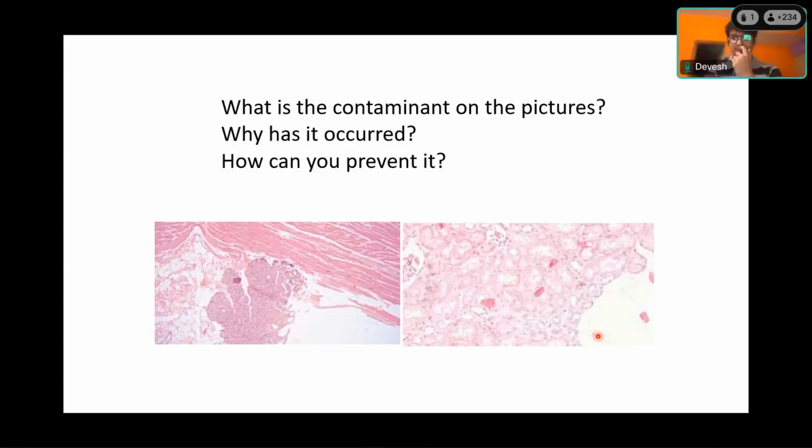Lysine. Lysine, glycine, maybe you can. But what we use is glycerol, which we make a solution of, and you put it in the water bath, and that will act as an adhesive.